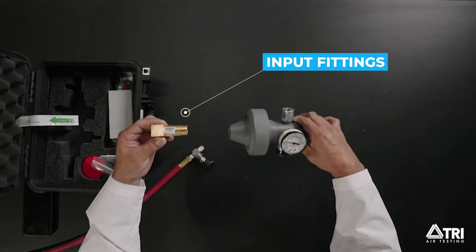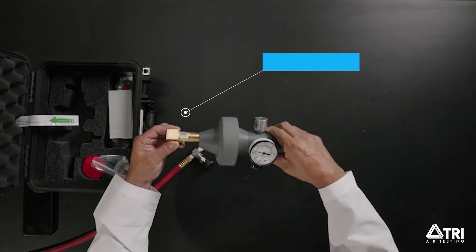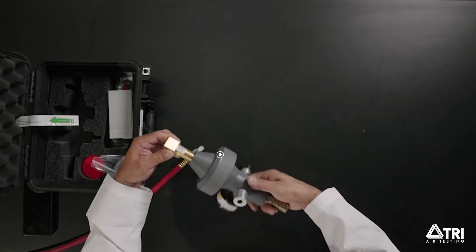Step 1. In your test kit, you will have input fittings that look like this. First, connect the input fitting to the flow section, which is here.